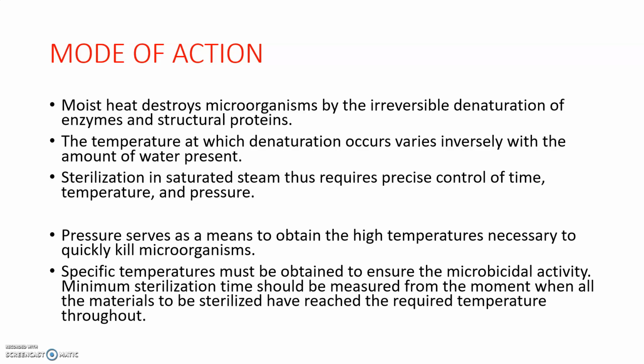Again, coming to the mode of action, it destroys the microorganism by irreversible denaturation of both the enzymes and structural proteins of the organism. The temperature at which denaturation occurs may vary inversely with the amount of water present. Sterilization in saturated steam thus requires precise control of time, temperature and pressure, which we have already studied last year about the autoclave.